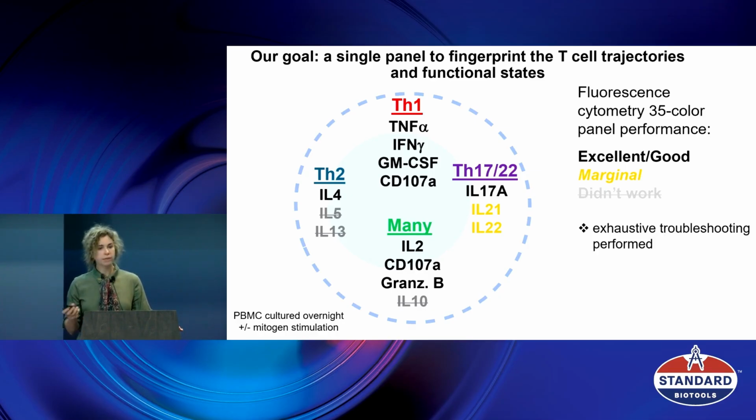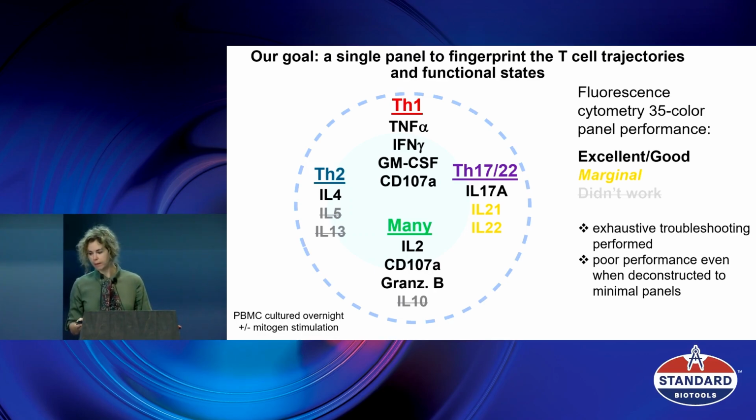And we did all the usual things, change the colors, deconstructed the panels to 3 colors, changed the fluorochromes, all the things you can imagine, right? And there were just some stubborn analytes that didn't work, okay? And unfortunately, we're not alone in that.